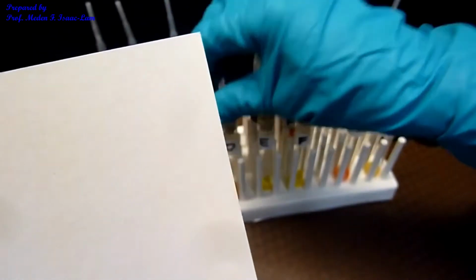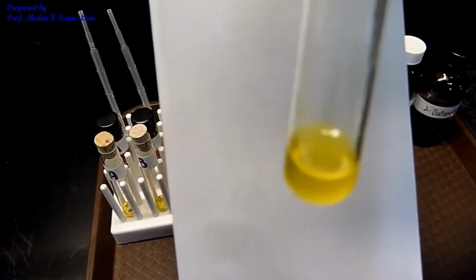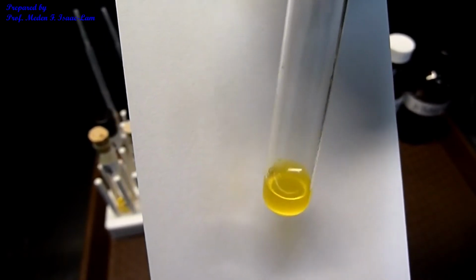And then unknown D is also the same, an orange precipitate. Unknown E is clear, nothing. And then unknown F is turbid, so there is some indication of precipitation, but the precipitate is small. F also formed a yellow precipitate at the bottom. So it's turbid.